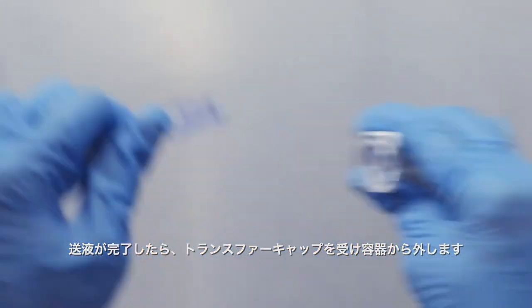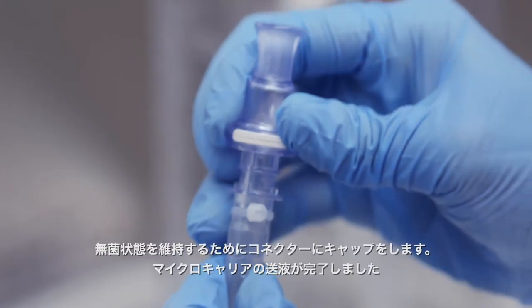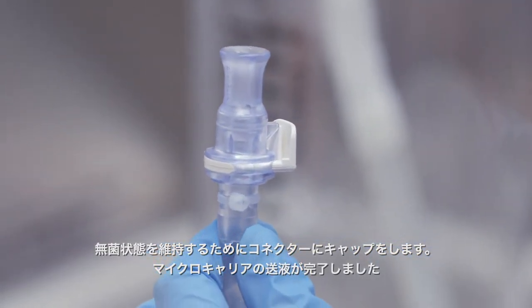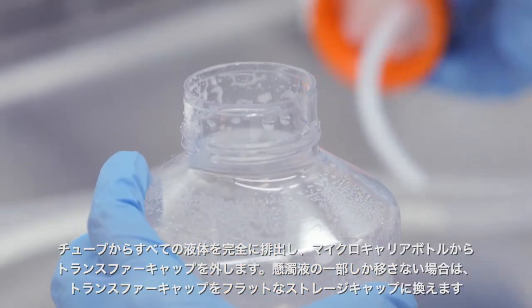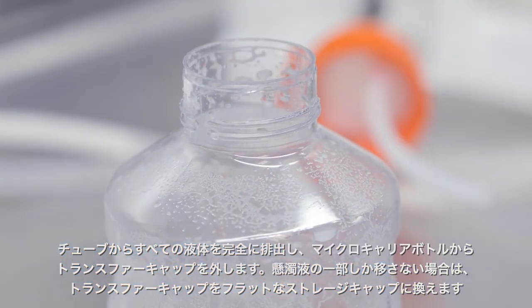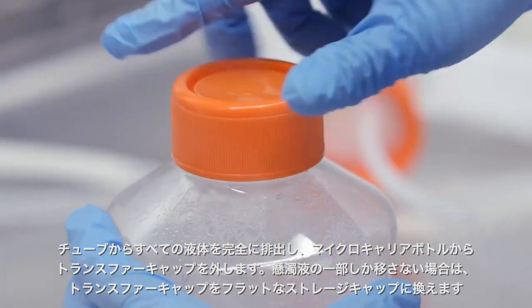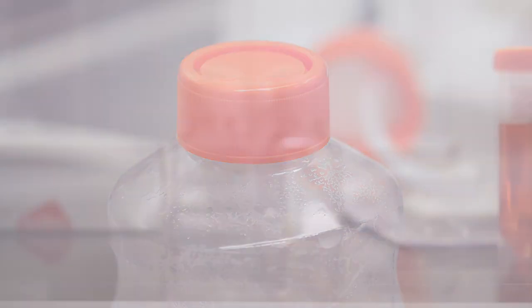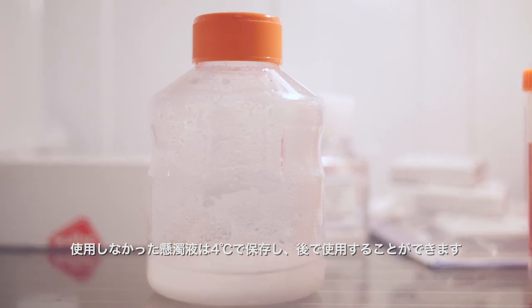After transfer is complete, disconnect the transfer cap from the receiving vessel. Recap the connectors to maintain sterility. The microcarrier transfer is now complete. Completely empty all liquid from the tubing and unscrew the transfer cap from the microcarrier bottle. If only a portion of the slurry is being transferred, replace the transfer cap with a flat storage cap. The unused slurry can be stored at 4 degrees centigrade for use at a later time.